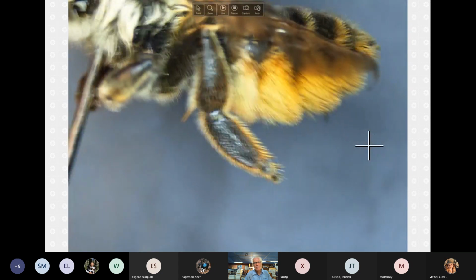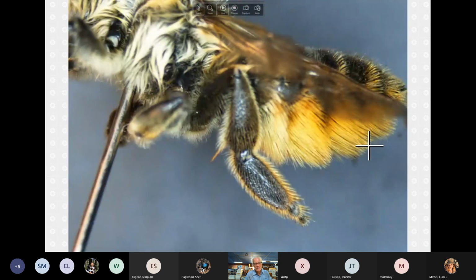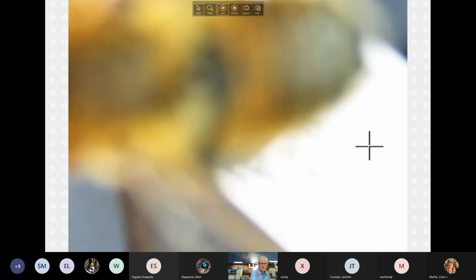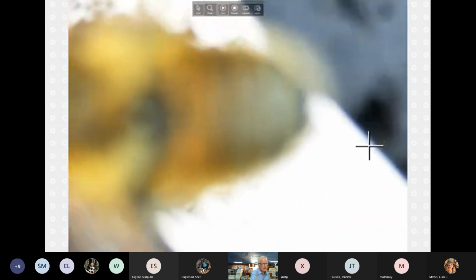So, oh, wait a minute, sorry. No wonder it's not presenting well because it's a female. Wait. Apologies. I have the male here. I thought I had it out. There it is. All right, let's redo this. Okay.